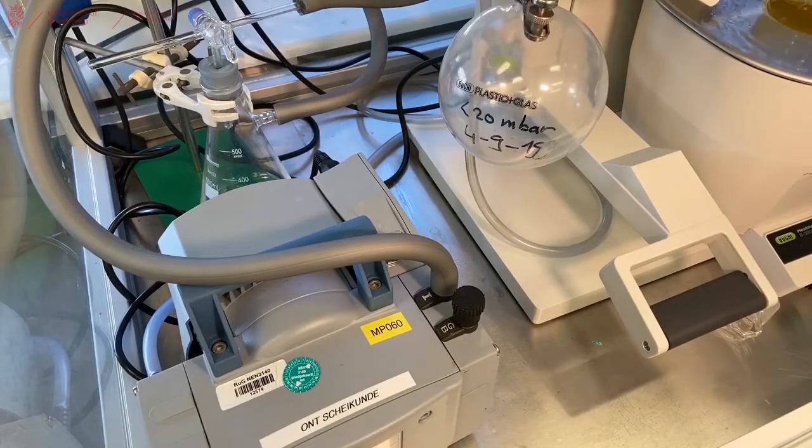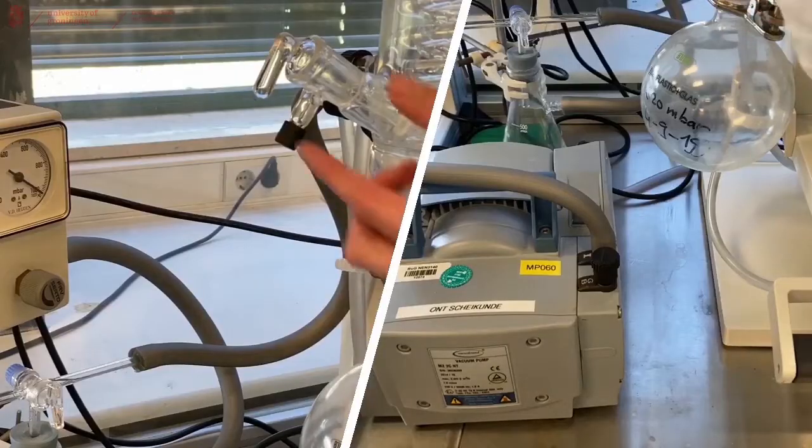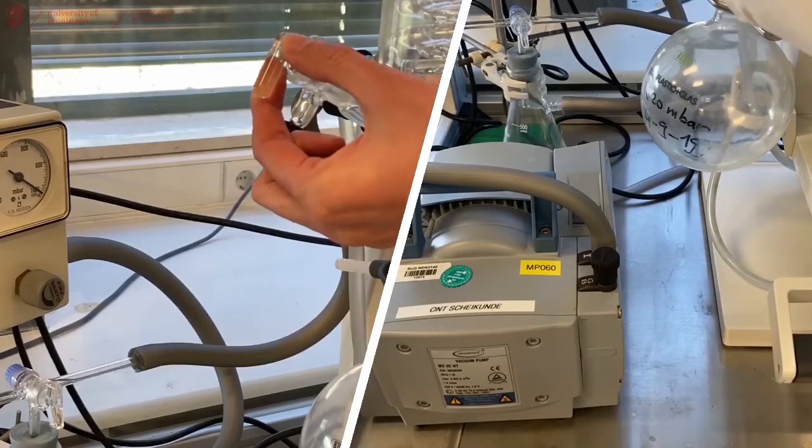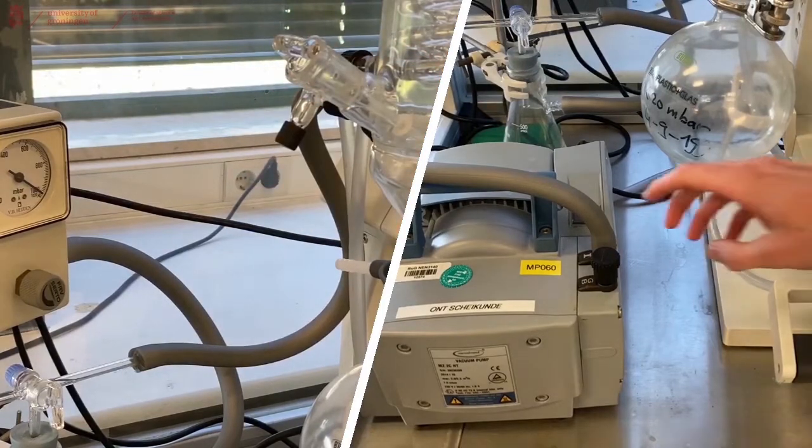40 degrees might not be enough to actually evaporate your solvent. So to make this machine go faster, we apply a light vacuum. Start by closing the tap all the way on the left hand side of the Rotary Evaporator. And then you can turn on the pump.